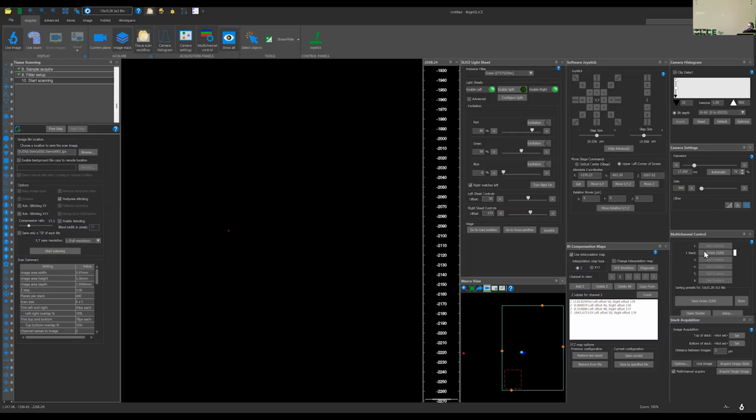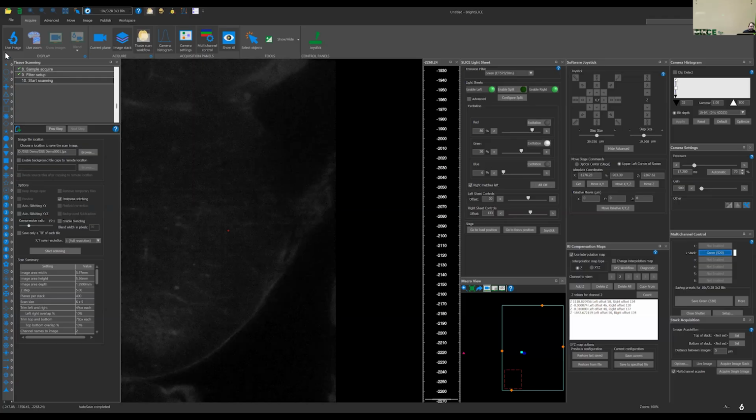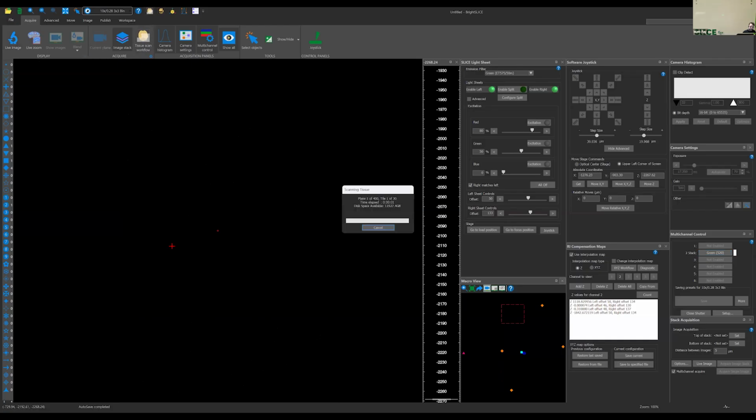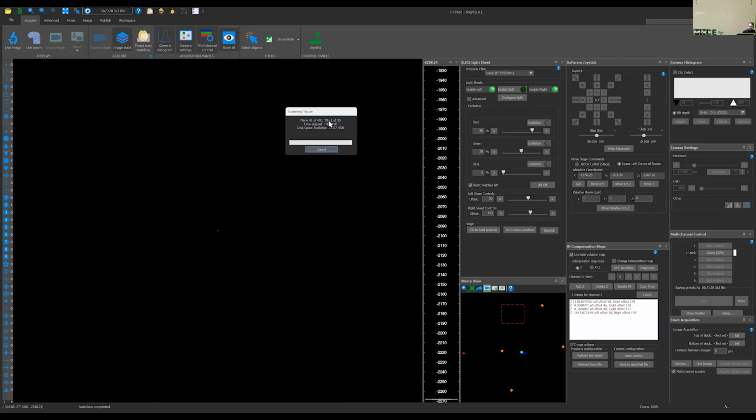Before I kick things off here, I like to just trigger my preset, make sure everything's coming up the way I expect, and then I will start our acquisition here. So this acquisition here, we're doing about a 1x30 scan with 400 planes. And this scan here would take us about 20 minutes. I have already actually acquired this sample, so we're going to cancel this scan and do a little bit of a cooking show demonstration for you.